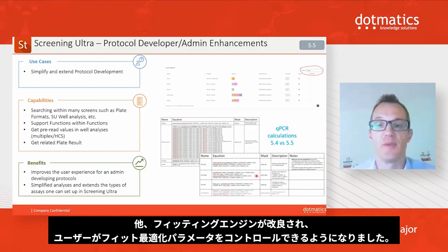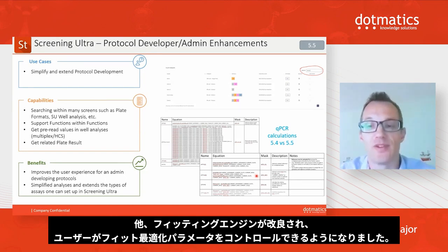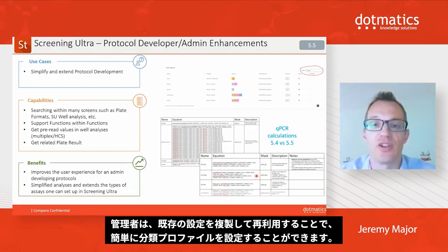The fitting engine has been improved, with users now able to control the fit optimization parameters, which should result in better results when dealing with non-sigmoidal fits. And administrators can also configure classification profiles more easily by cloning existing configurations and recycling them.